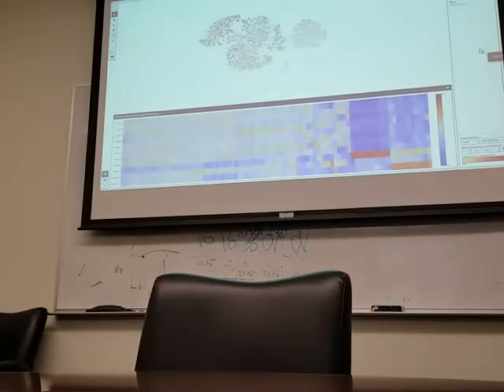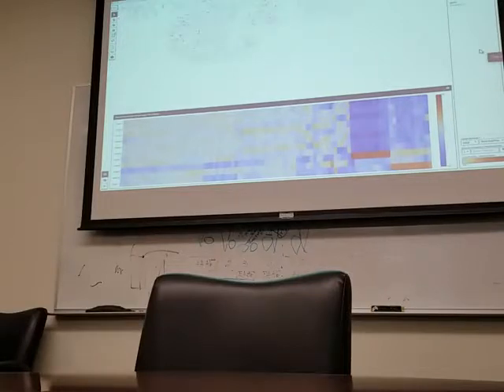Yeah, it looks like this line up here, and then some of the ones down here aren't a part of these. Right. Oh yeah. No, we know that to be the case. Yeah, that's clear. And that's not even the question. It would be nice to get rid of them and do the t-SNE plot without those having an influence as a weight on the other one because they must be a pretty big weight. But that's for somebody else to worry about, why B cells don't always express all the markers they should.